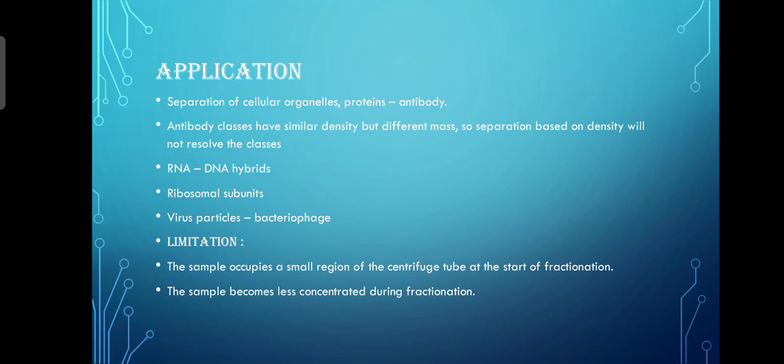There are some applications. It is used for separation of cellular organelles, protein antibodies. Antibody classes have similar density but different mass, so separation based on density will not resolve the classes. It separates RNA-DNA hybrids, ribosomal subunits, virus particles such as bacteriophage.